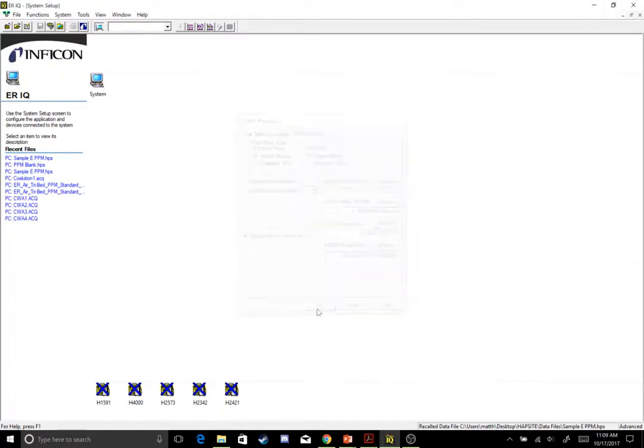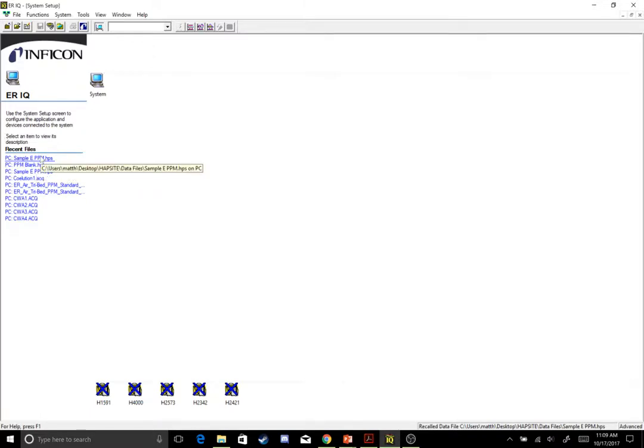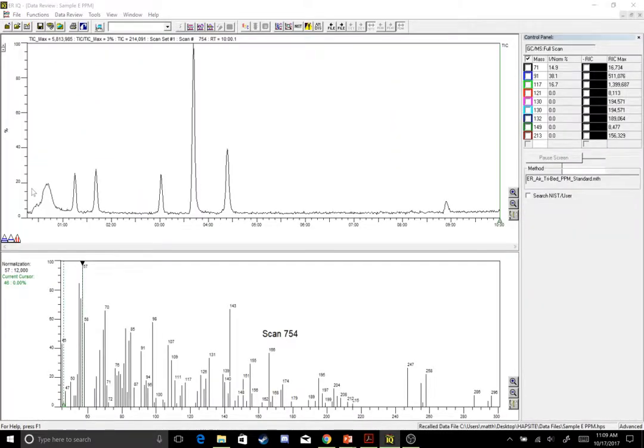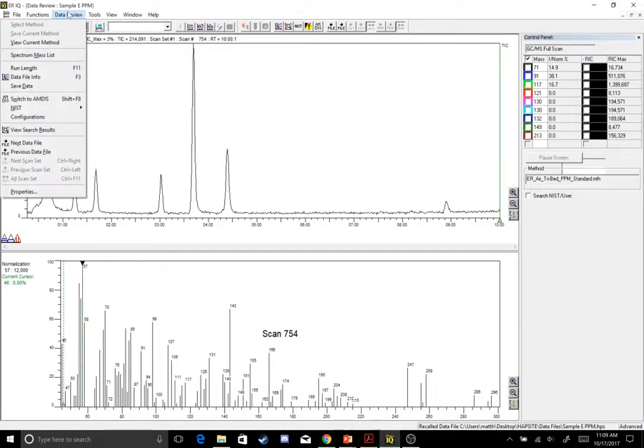Now that that's set up, I need to go to Data Review and further set up my NIST. So I'm going to open up a sample, Sample E. Doesn't matter which data file you open up, as long as you're opening up a data file, and you can go to Data Review here at the top.